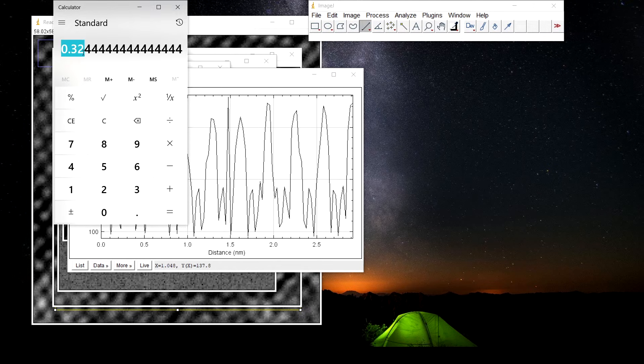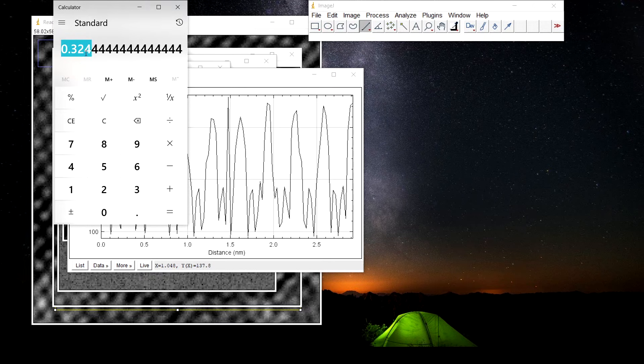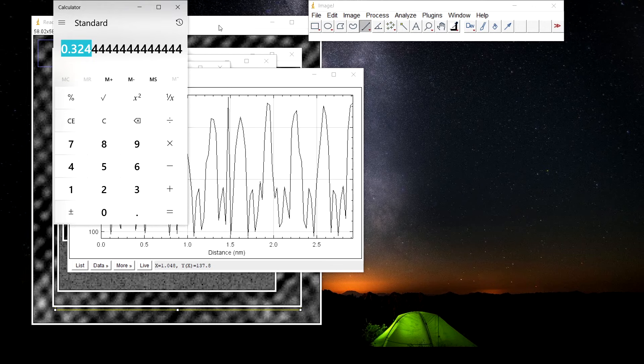This is the lattice spacing between the two atomic layers, inter atomic spacing between two atomic layers. This is 0.324 nanometer.